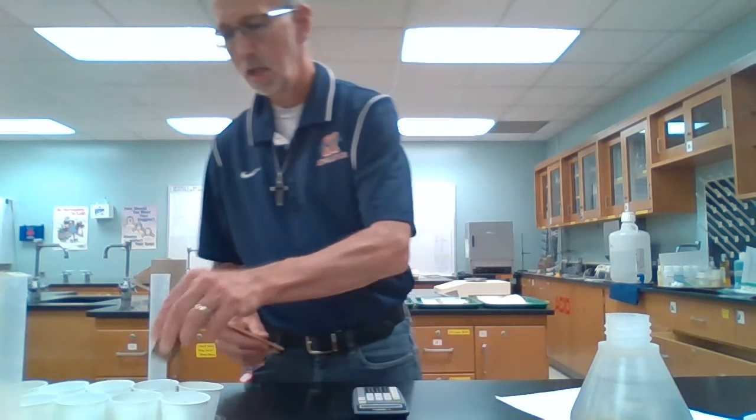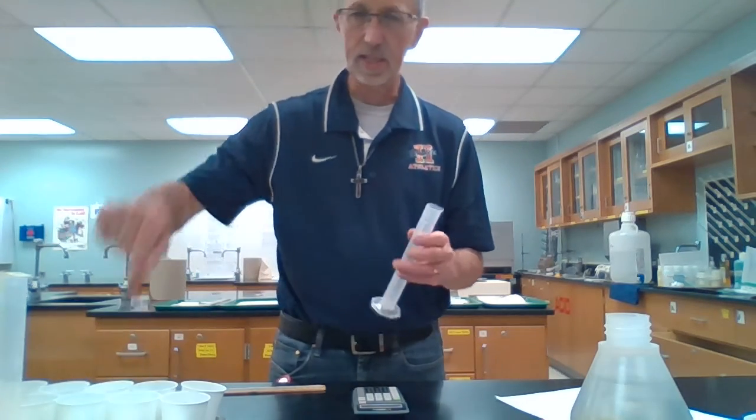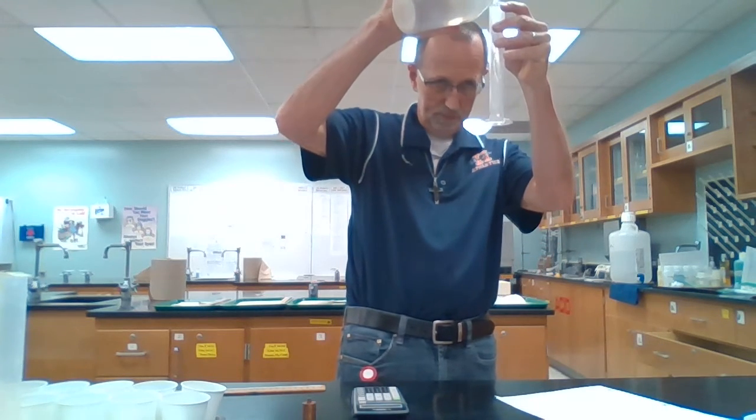So actually a cube that is 1 centimeter on a side will hold exactly 1 mL of liquid. So centimeter cubed, mL, same volume. Okay. All right. Number 3 is this cylindrical shaped thing, but it's got that little thing on top, so we're going to have to use water displacement again.